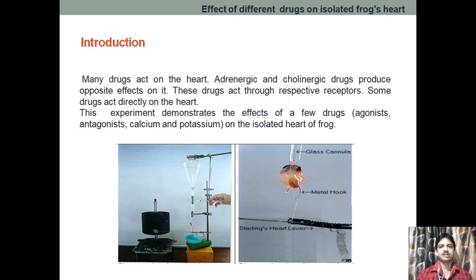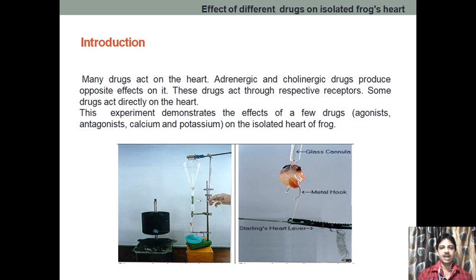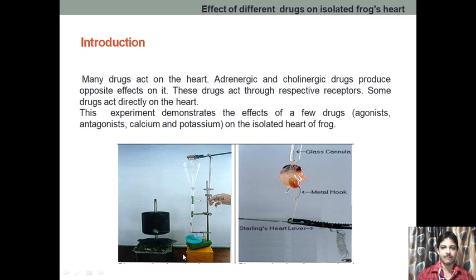The different drugs will act with different activity. Here we are going to perform the experiment on the isolated frog heart. This is the experimental setup.